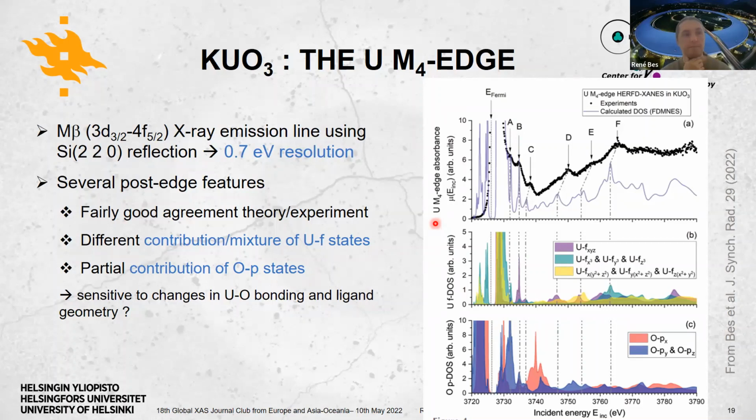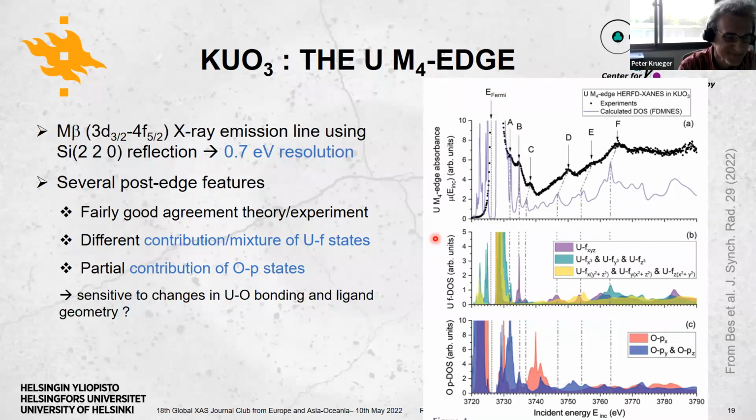Let me think. Normally it's perfectly cubic, so they should be almost similar. But I think it comes from the way the harmonics are made by themselves, showing a slight difference, because the Py and Pz are probably a mixture of the P states. I cannot figure it out by heart right now, but I can have a look later if you want. Thank you. Yeah. That's all.